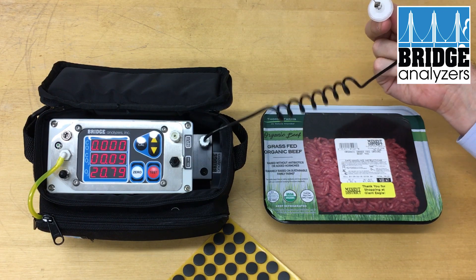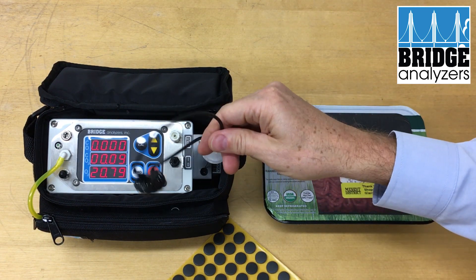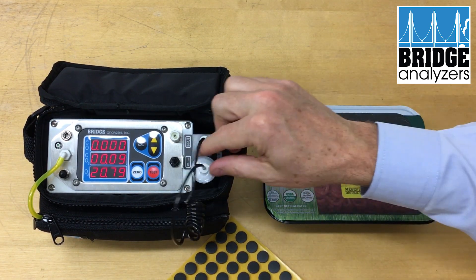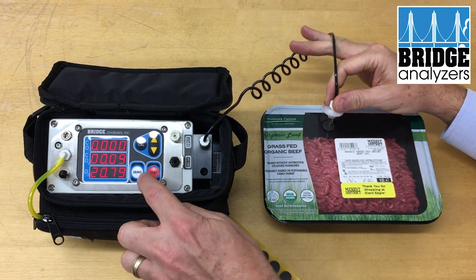Right now I'm not drawing any gas through the sample line. What I'm going to do first is apply a septum to the package. Then I'll go ahead and put the needle in and hit the test button.